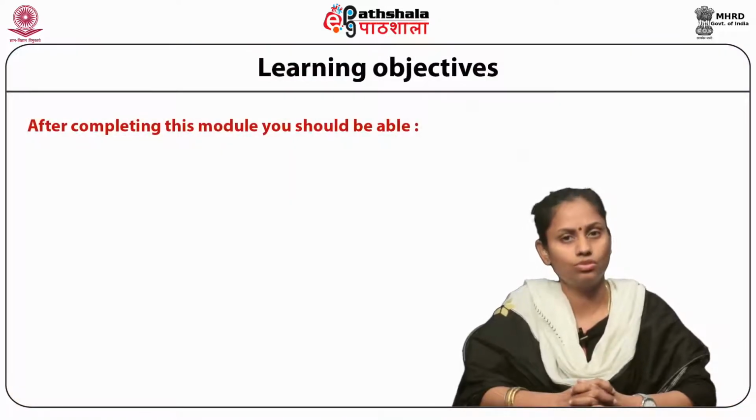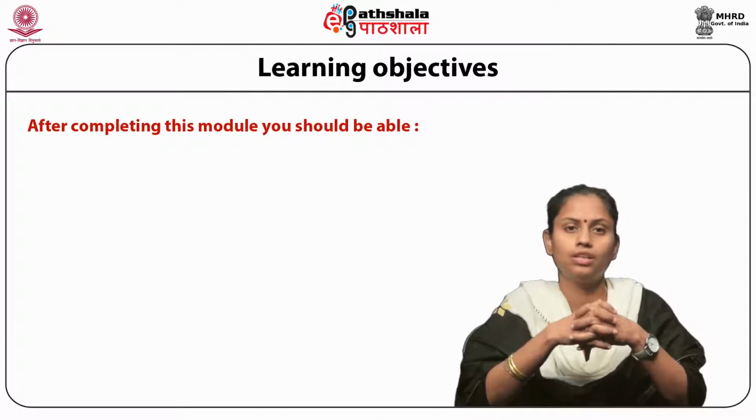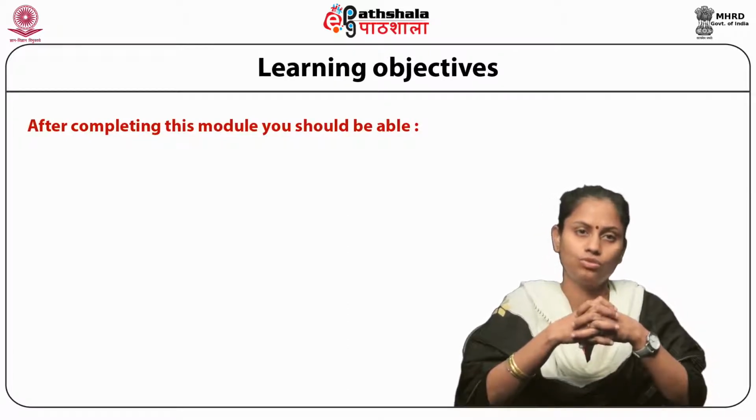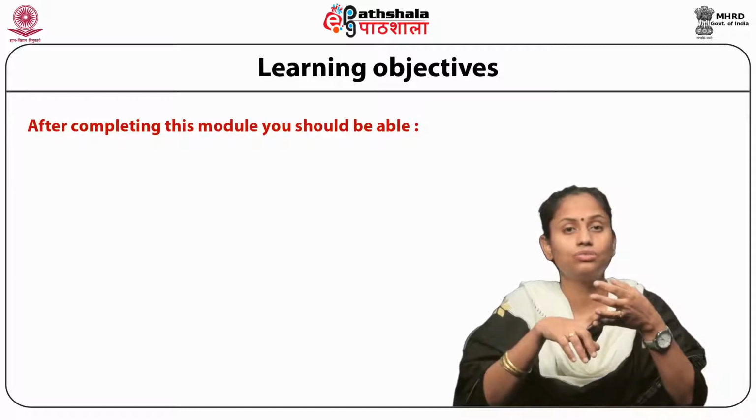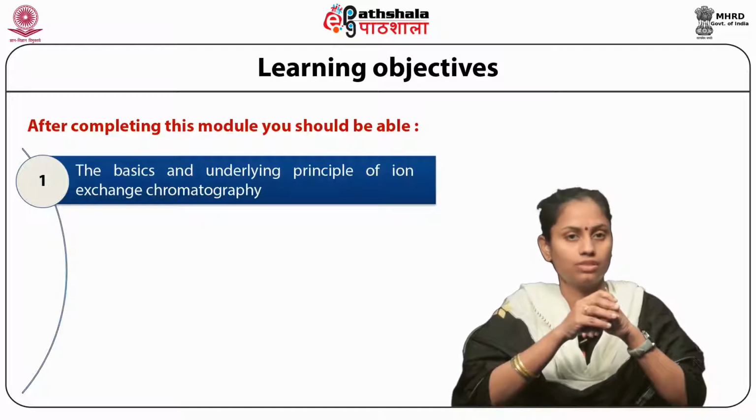Today we are going to talk on the module Ion Exchange Chromatography: Introduction, Types of Resins and Mobile Phases, under the paper Chromatographic Techniques 2. After completing this module, the students will be able to understand the following learning objectives. First, the students will understand the basics and underlying principle of ion exchange chromatography.